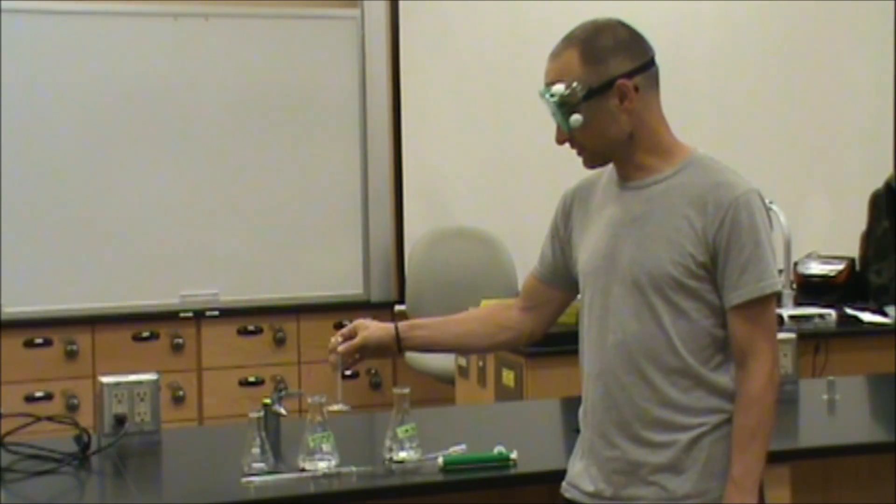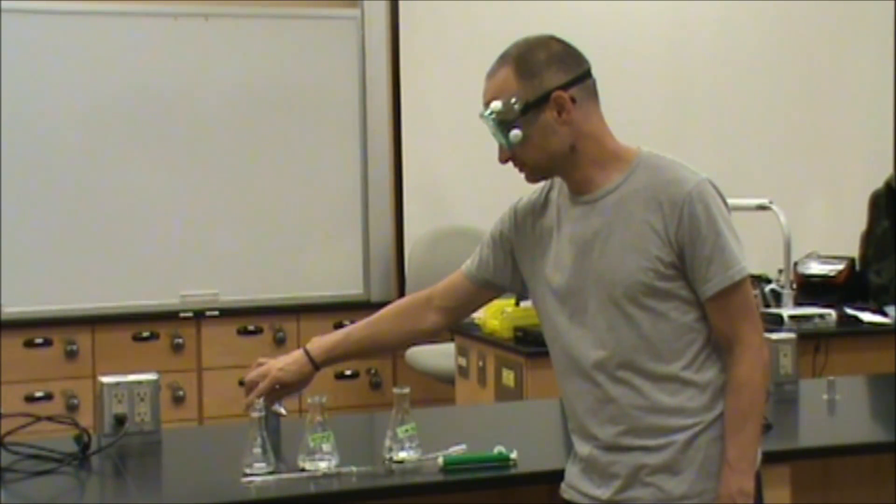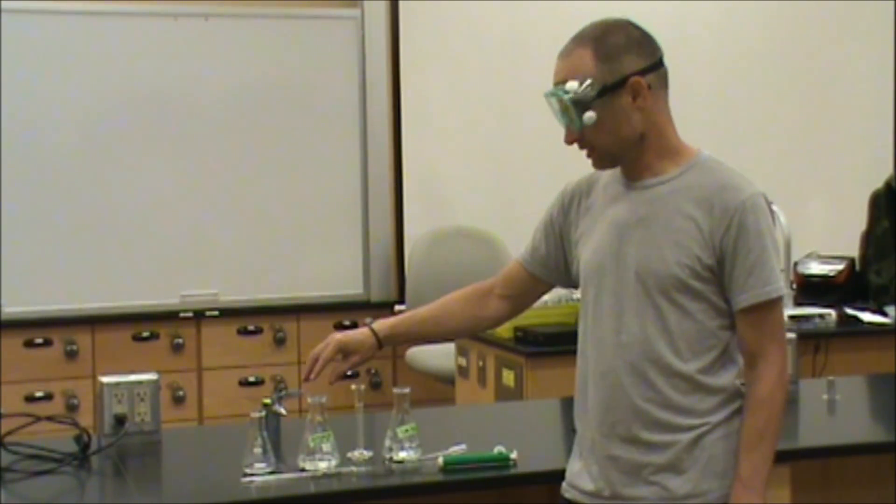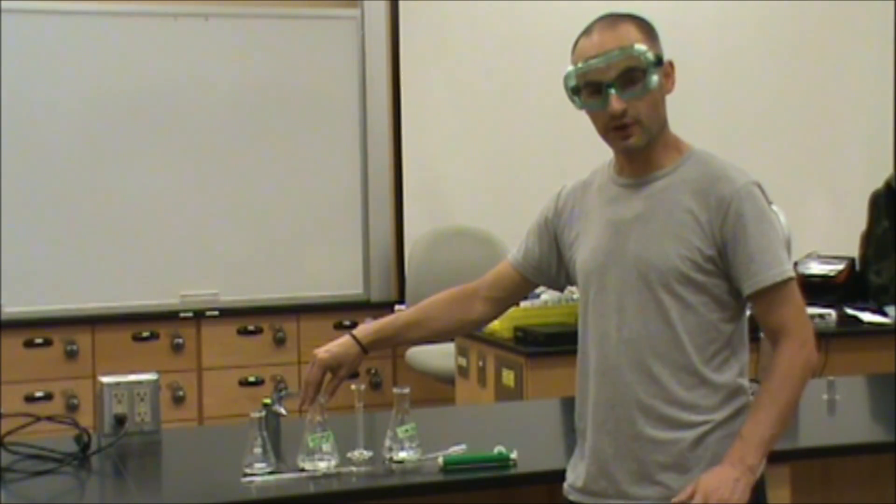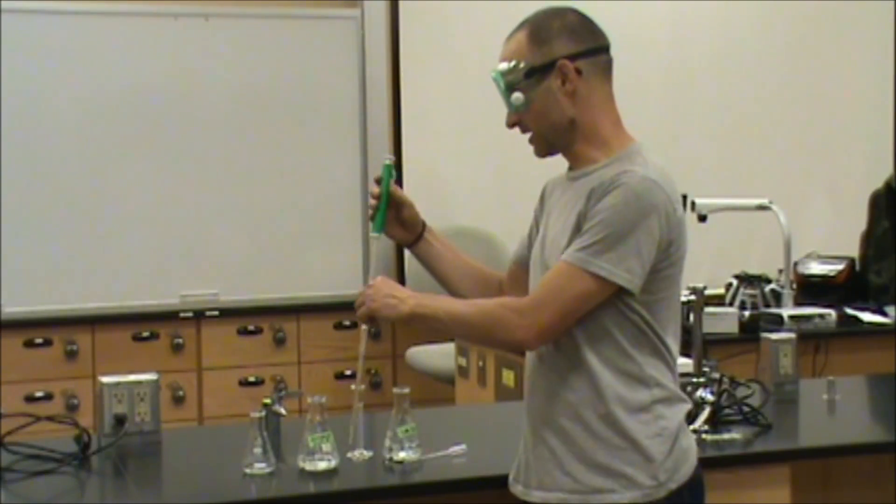I'm now going to add the 10 milliliters of sulfuric acid to our 125 milliliter Erlenmeyer flask. The peroxide, on the other hand, our volume measurement does have to be very accurate, so we're going to be using a volumetric pipette for this.